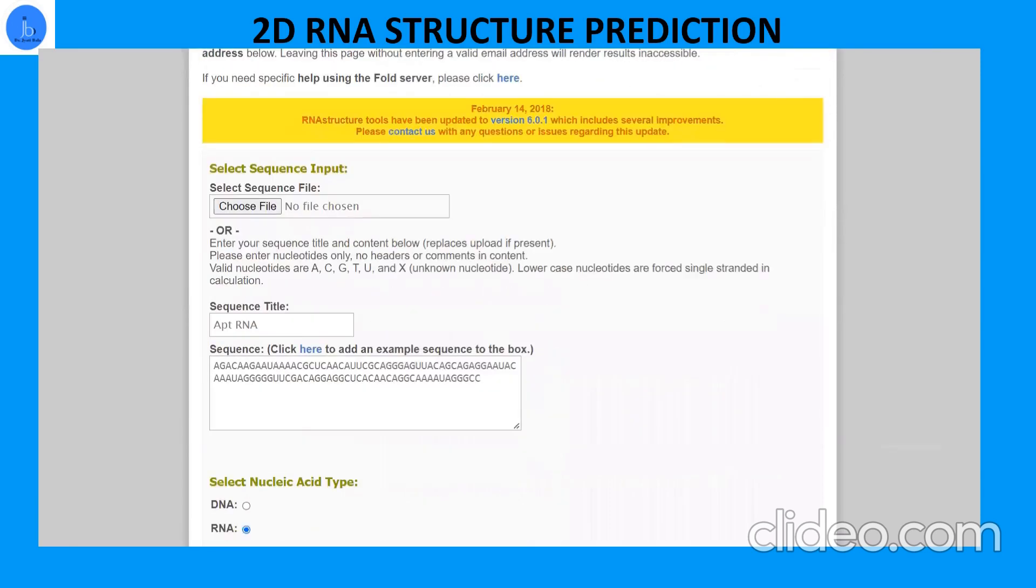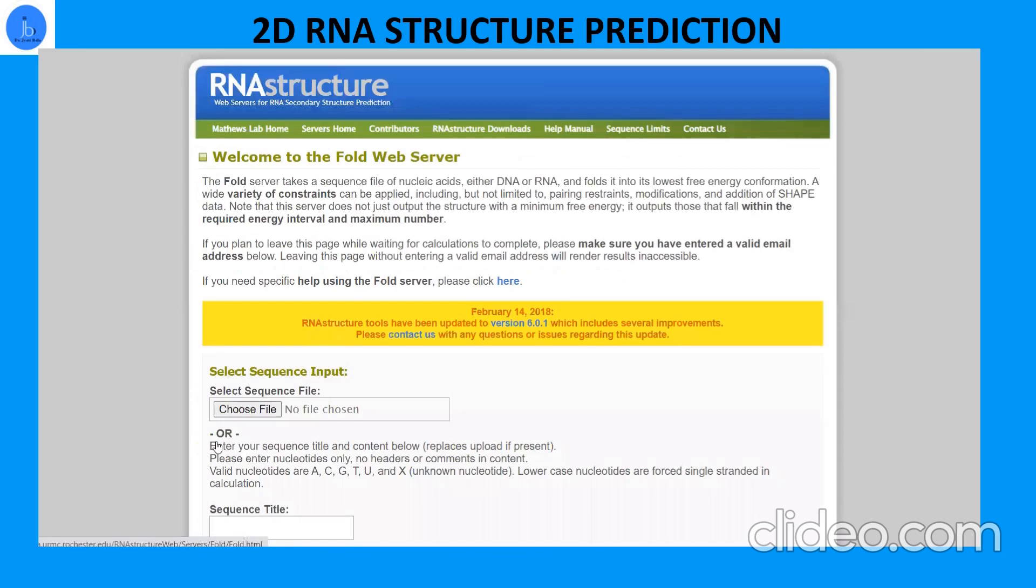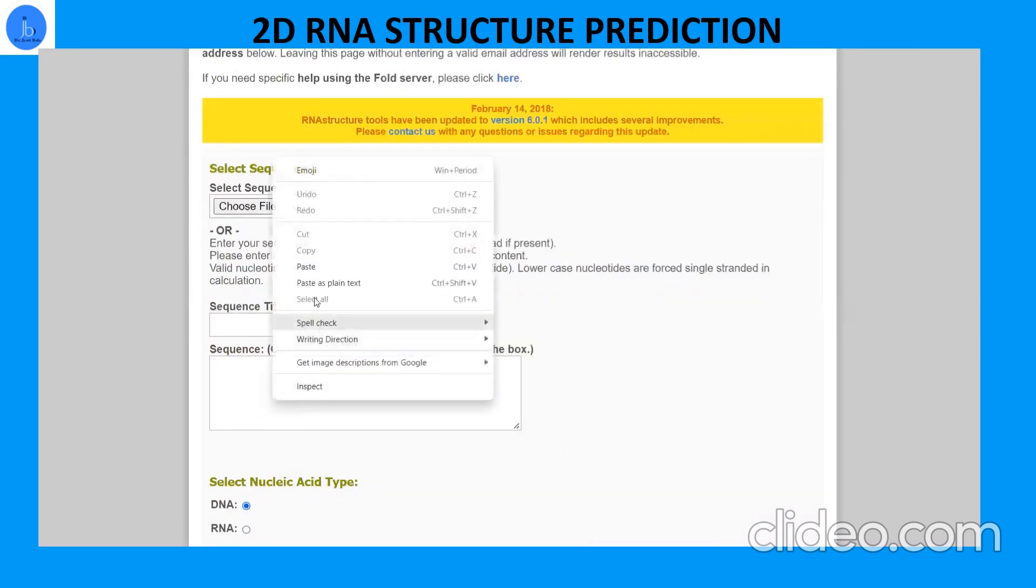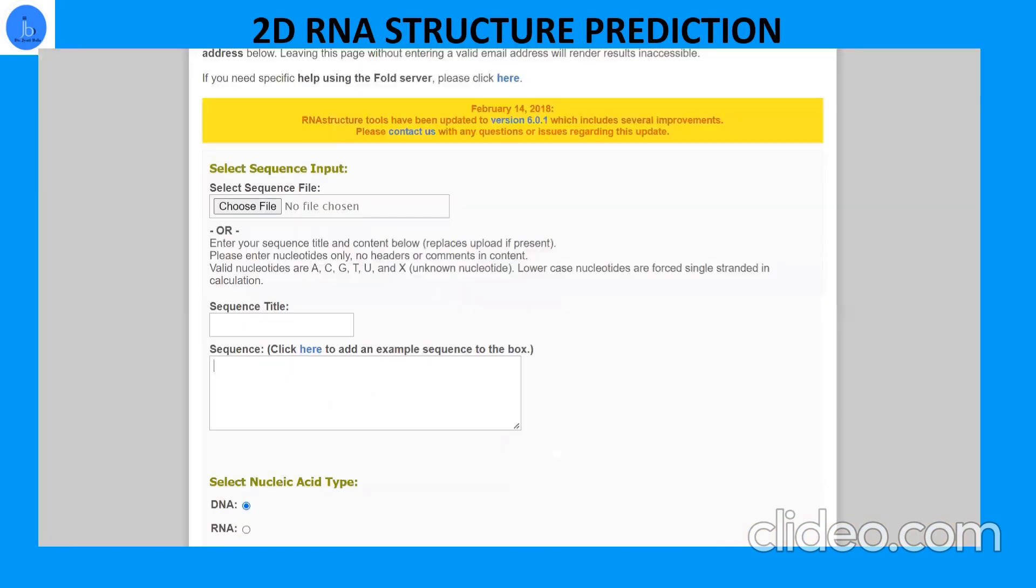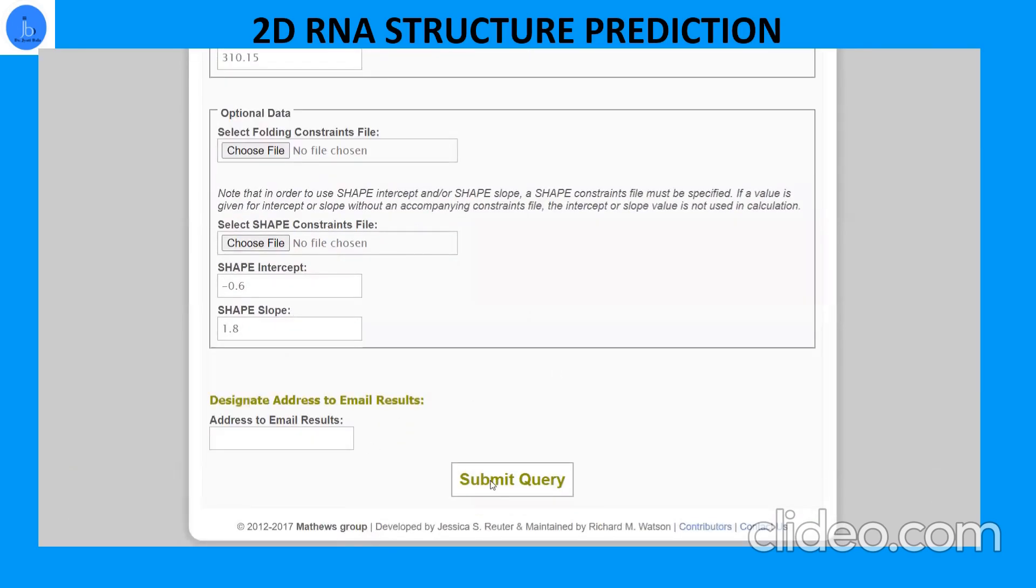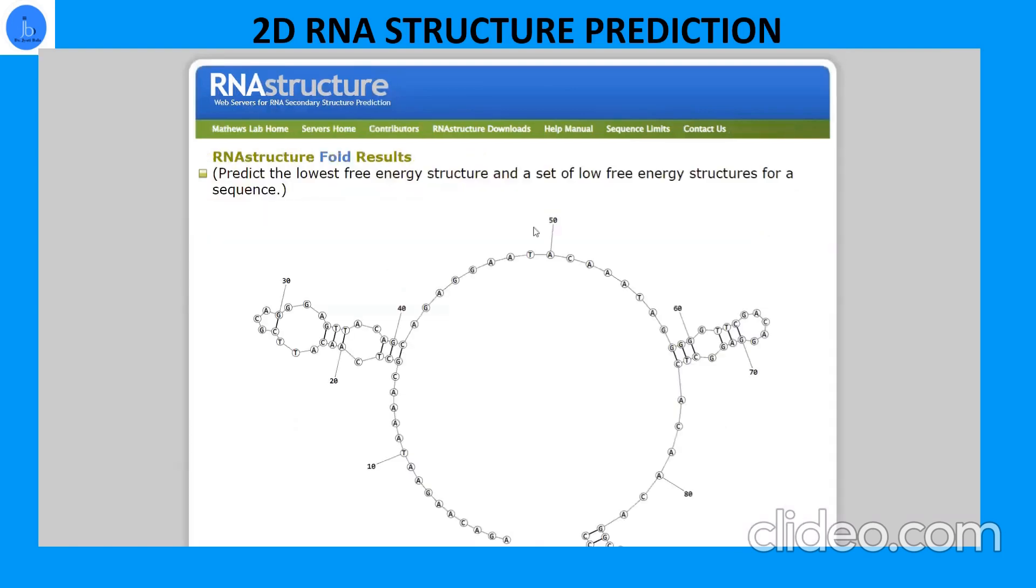If suppose you want to do for DNA purpose, then you just have to go to the fold. Instead of RNA, we just have to click on DNA and we have to provide a DNA sample. You can type the sample name and run in the similar version. So based on that, you are going to get your secondary structure result.